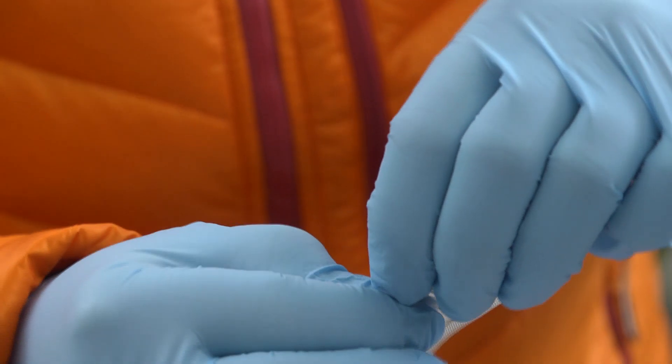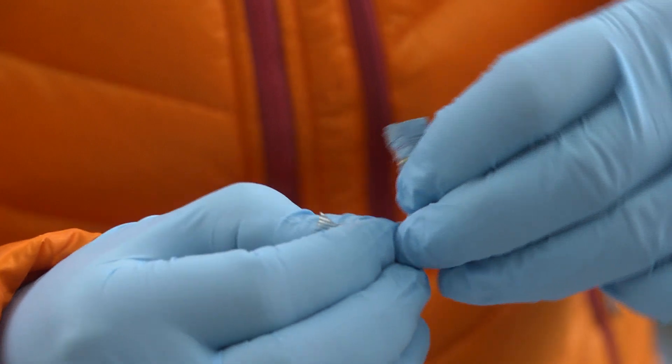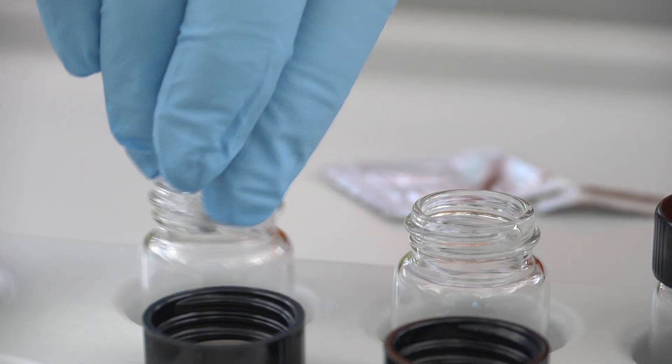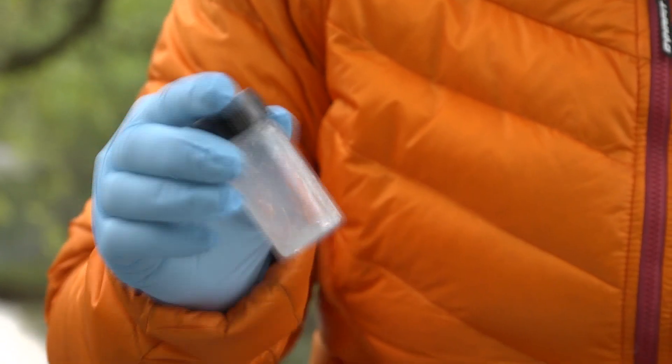Powder pillows are ideal for fieldwork since they can be poured directly into the samples. Shake vigorously for 10 to 15 seconds. It does not matter if some of the powder remains undissolved in the vial — it does not disturb the reading in this case.